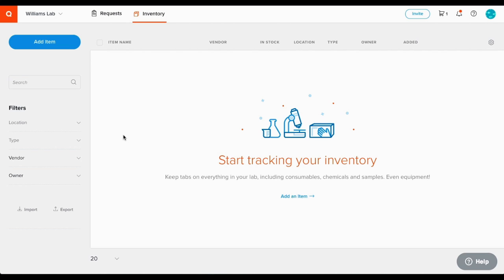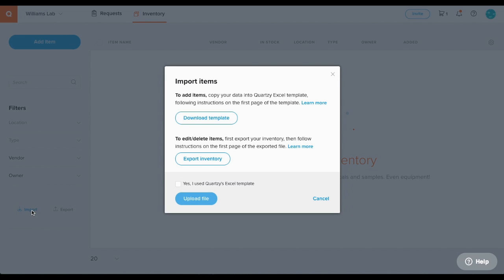As I mentioned before, there are multiple ways to add items to your inventory. The first option is to click import on the left sidebar and download our template if you want to import your items in bulk from an existing list.